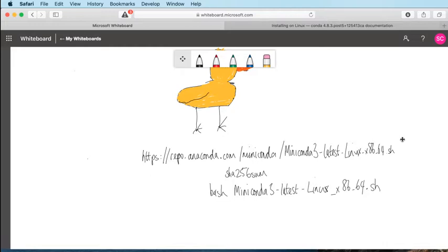I think somebody commented that they couldn't get the 64-bit version to work, even though their VM was 64-bit. So they downloaded the 32-bit version instead. In theory, that won't have huge effects. It will just be that Miniconda will install the 32-bit version of all the software rather than the 64-bit version.